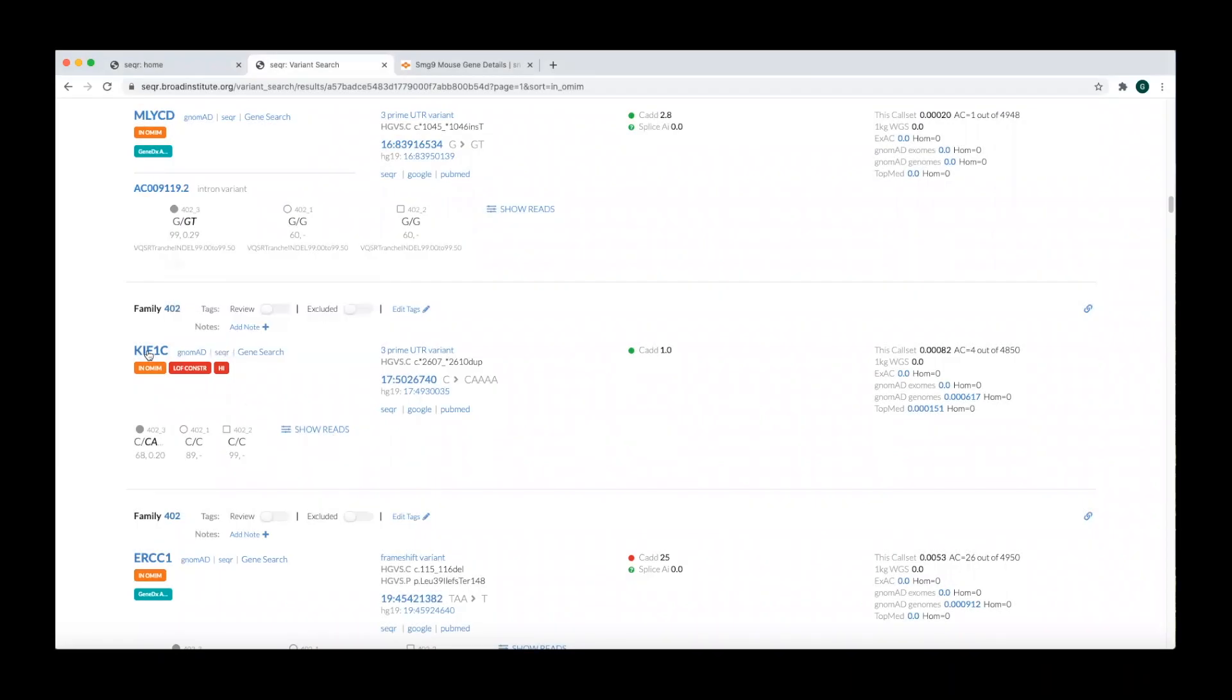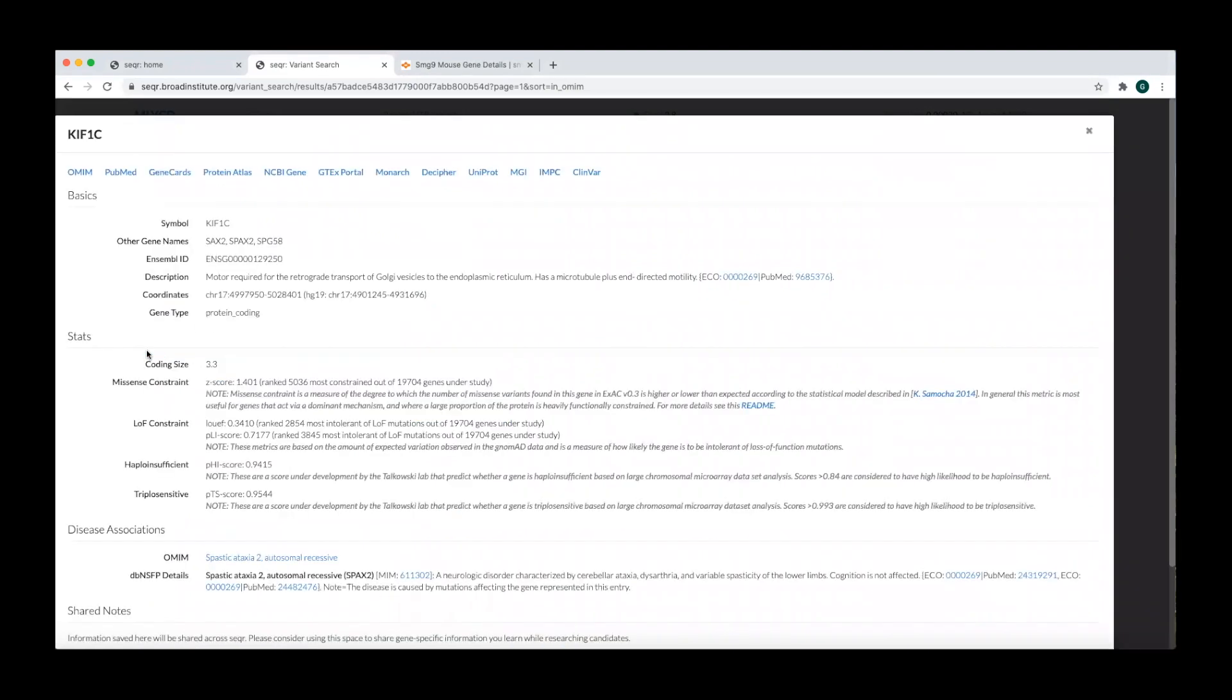Starting from your search results, clicking on the gene name opens the gene page. Various information is presented on the gene page.